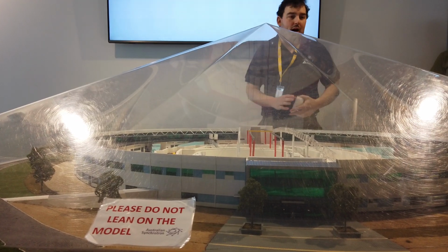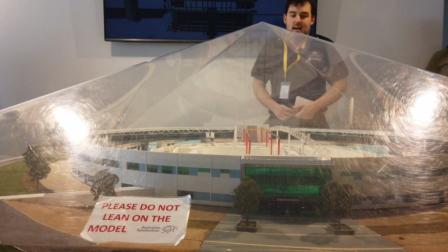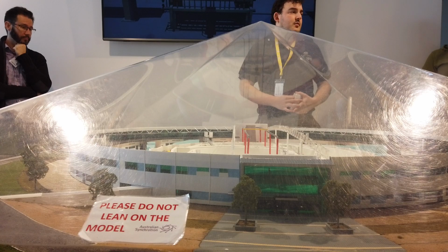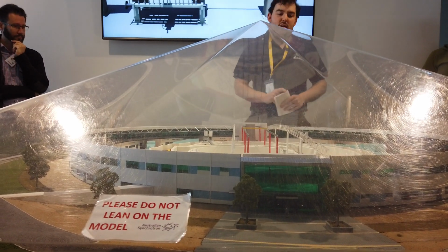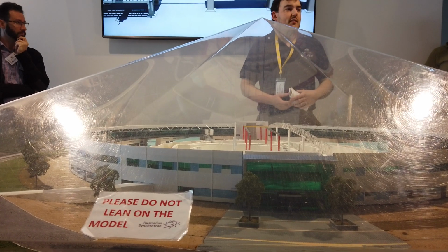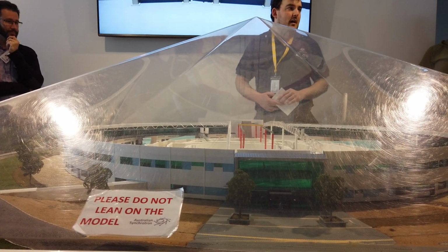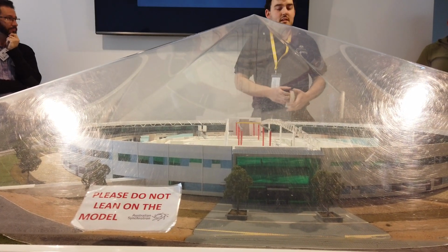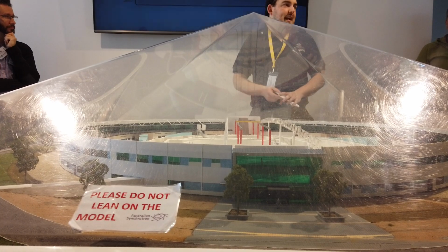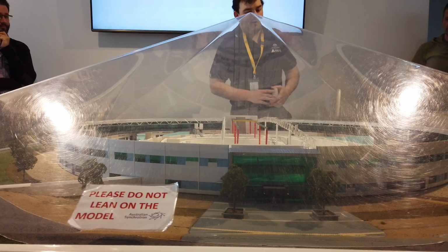Obviously, the synchrotron is a particle accelerator. We are an electron accelerator here. The synchrotron started its construction in 2006 and was finished in 2008 with a construction cost of approximately $213 million. With that money, they were able to build 9 beamlines when the synchrotron first opened, although we have recently received a grant over the last few years for another 10 or so beamlines. We have a maximum capacity of 38 here at the synchrotron.